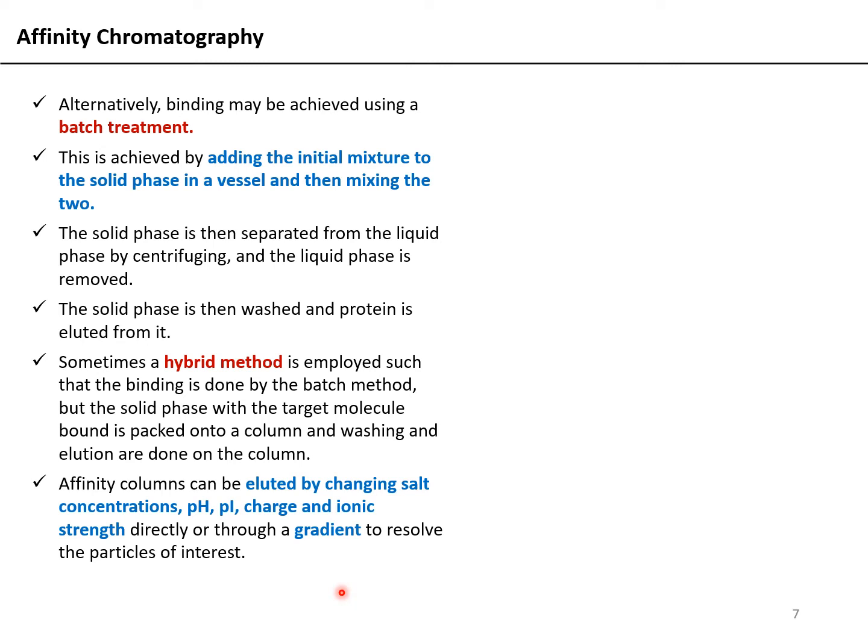Why? Because naturally proteins will also have some histidine residues, proteins other than your protein of interest, and by virtue of these histidine residues, these proteins will also bind onto your nickel beads. So to remove them, you have to apply lower amounts of imidazole, and at higher concentration of imidazole, your protein of interest, which has a longer histidine tag, possibly a 6 or an 8 histidine tag, will elute out.